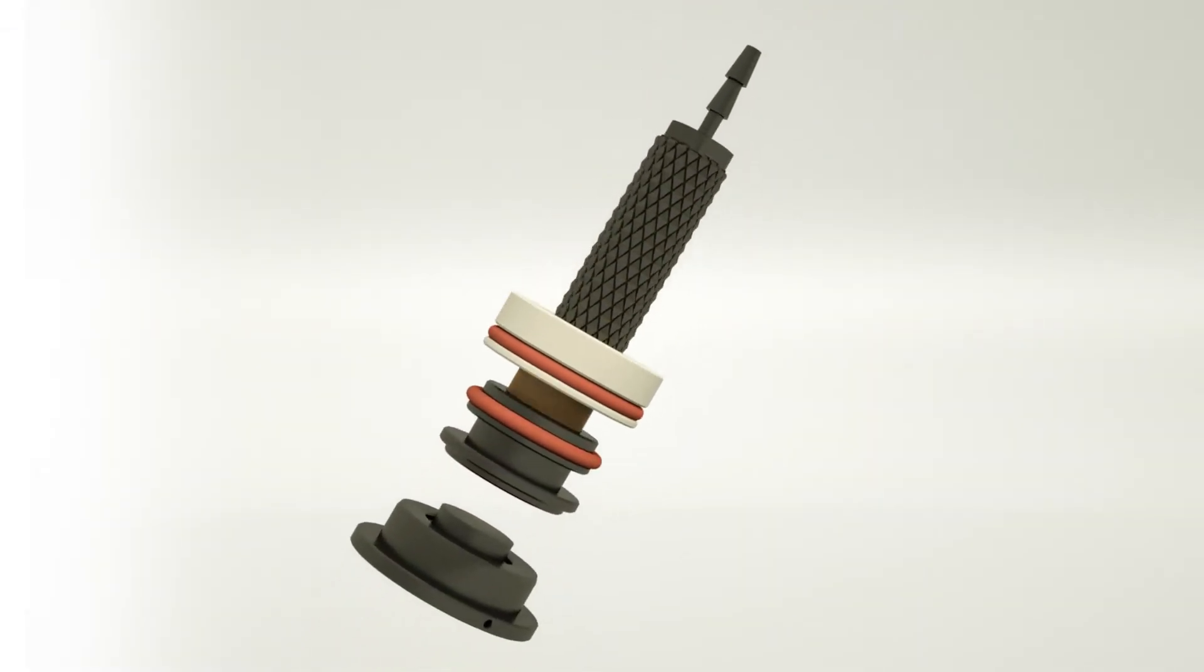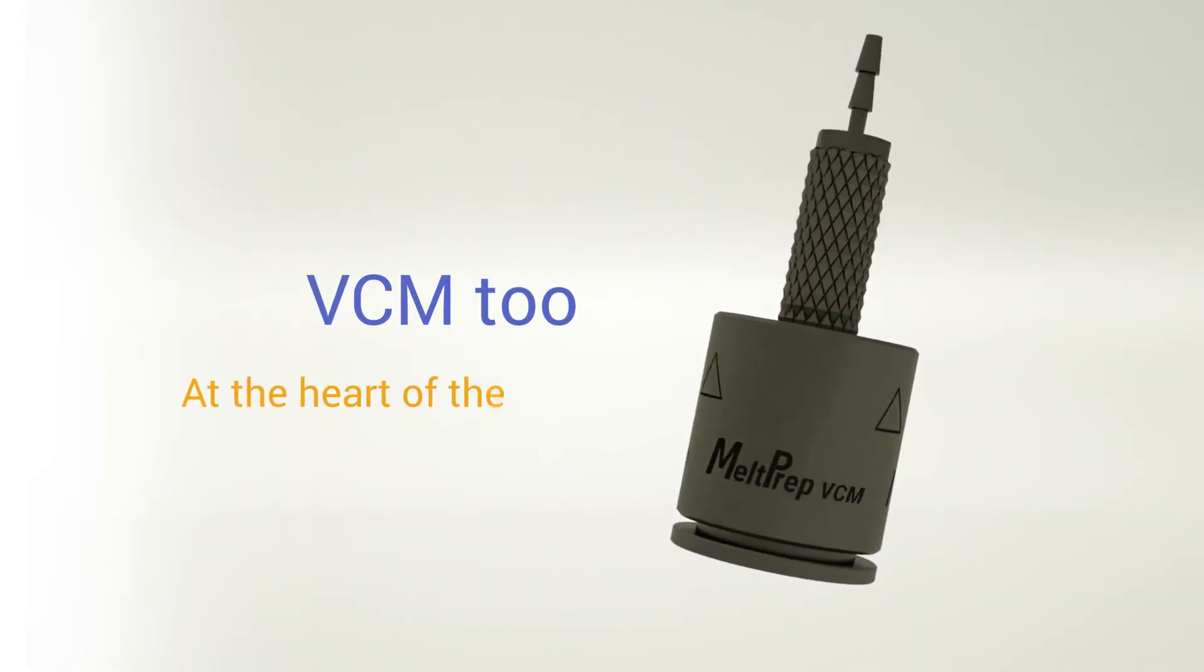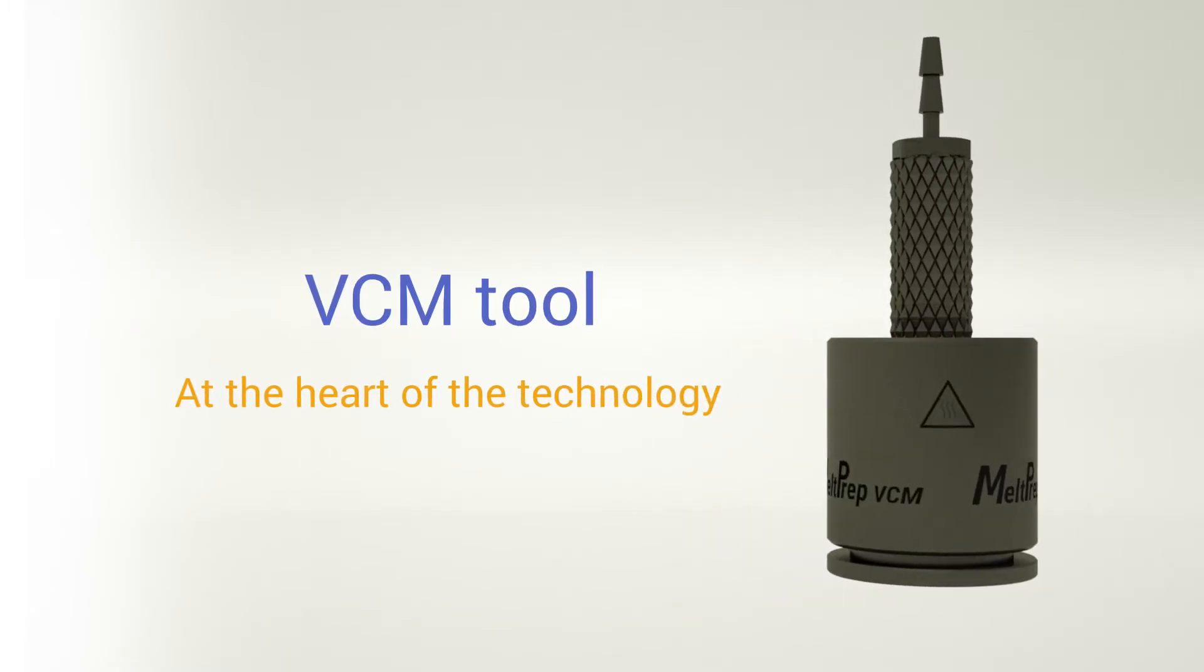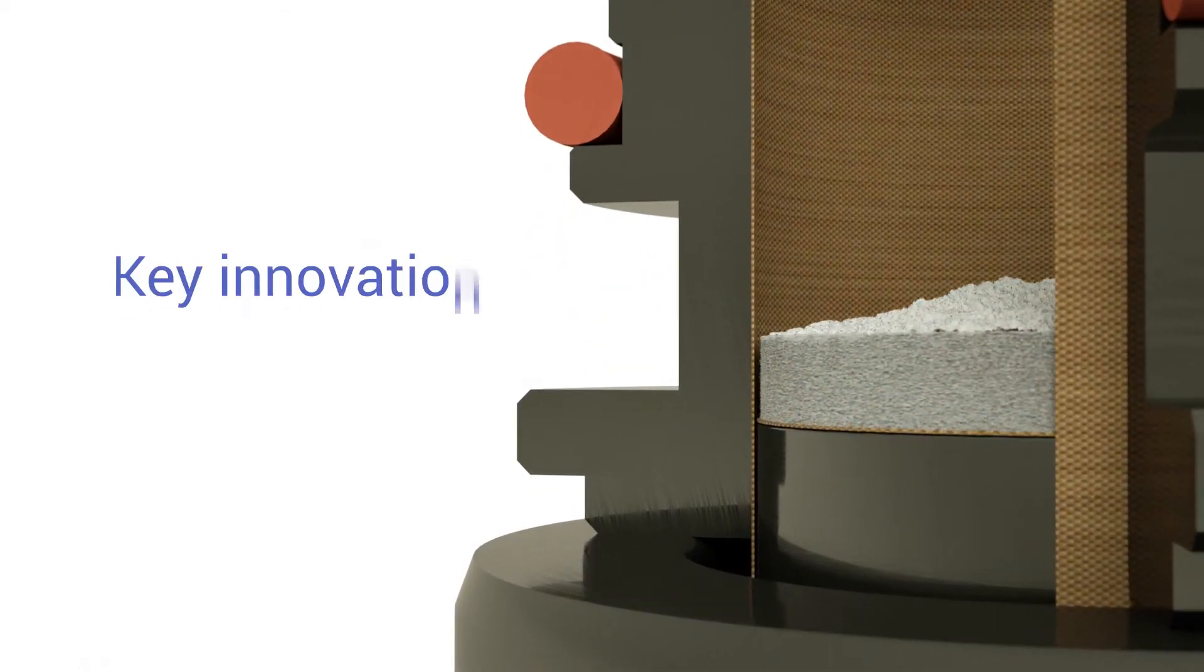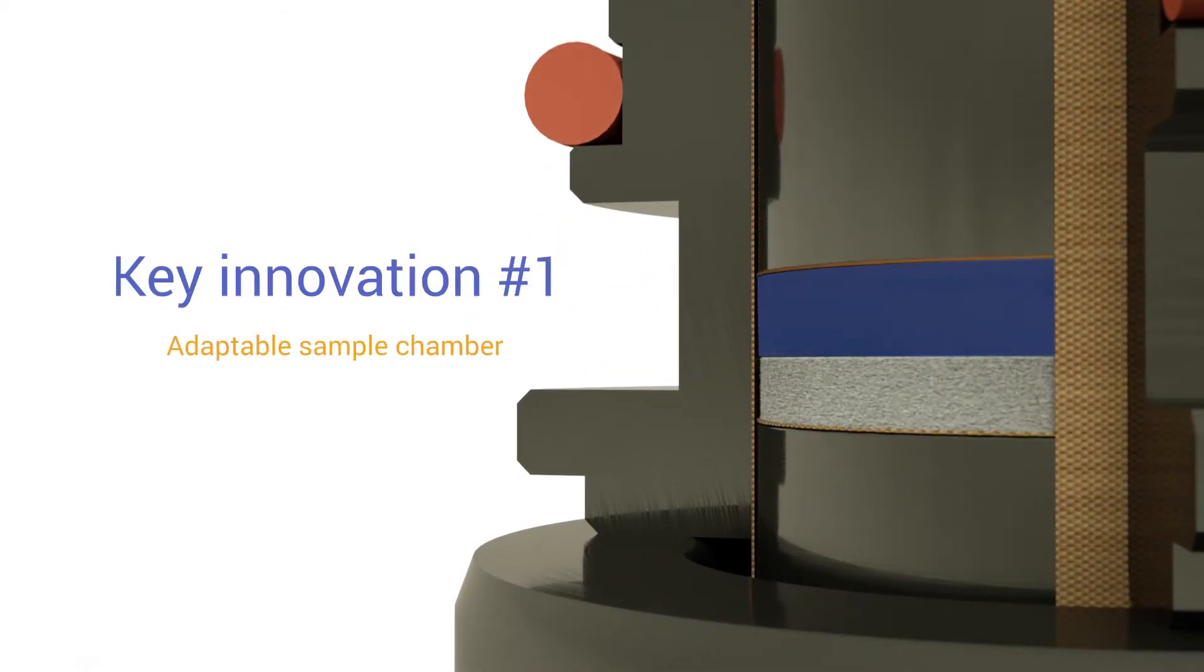At the heart of Meltprep's groundbreaking vacuum compression molding technology lies the VCM tool. The VCM tool's first key innovation is its adaptable sample chamber which adjusts automatically to the amount of material inserted. The result is an entirely lossless sample preparation process.